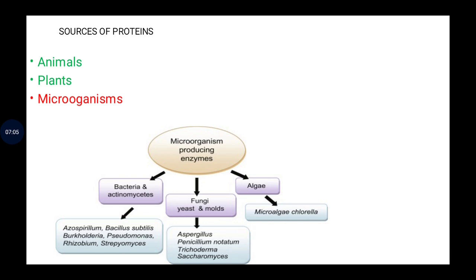That is why they can be easily generated in large amounts, into a high or large biomass in a culture media, thereby producing your enzymes of interest in large quantity, and their system is much easier to control than the eukaryotic system. And at the same time, the production of the proteins is much faster because they mostly operate under an operon system.